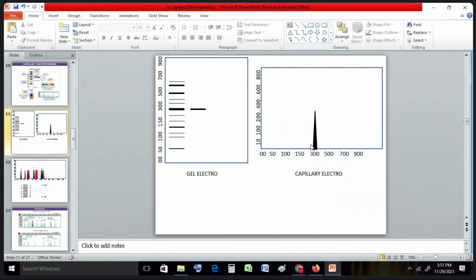Thank you, sir. So for each and every locus result you expect, as I've said before and say again, either 2 bands or 2 peaks, or a single band or single peak. Whenever you see 2 peaks for any result, in DNA fingerprinting you can understand that for that locus, that PCR, the locus contains heterozygous or different numbers of repeats. Or if you see a single peak, you can confirm that the locus contains the same number of repeats, or it is homozygous. Okay.